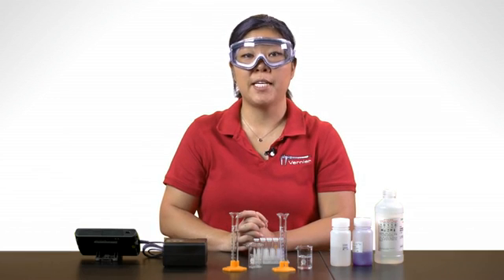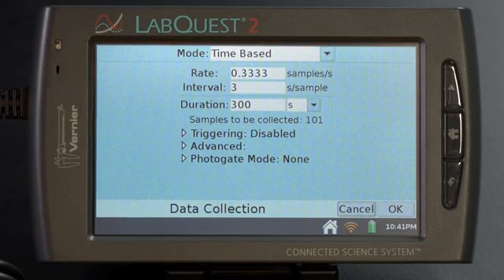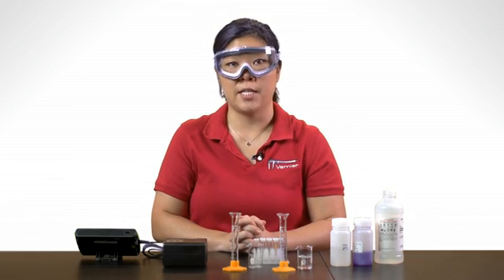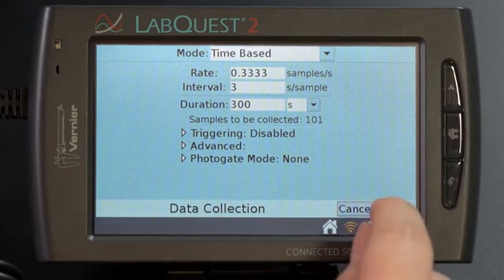Now you will set up the data collection mode. Tap on the graph mode box. The screen changes — make sure you choose time-based. Decide on an interval and duration for your data collection and make any necessary changes. You can also do a trial run and use the default settings to check how long the reaction proceeds and how often you should record a reading of absorbance from the colorimeter. I'll be using the default parameters and tapping OK to complete the setup.